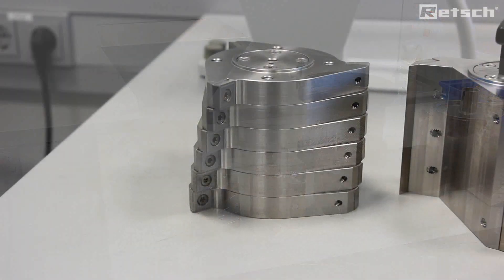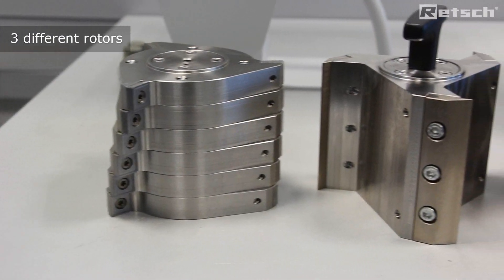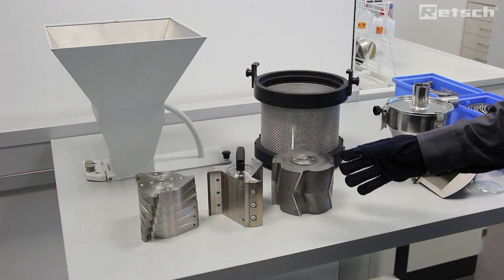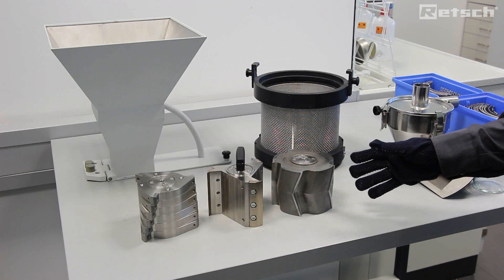Furthermore, there are three different types of rotor to allow for different types of material to be prepared in different application areas.